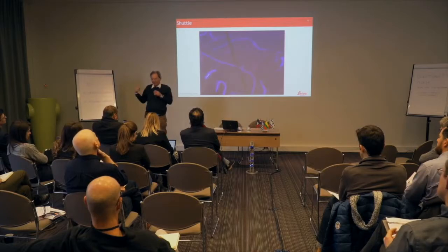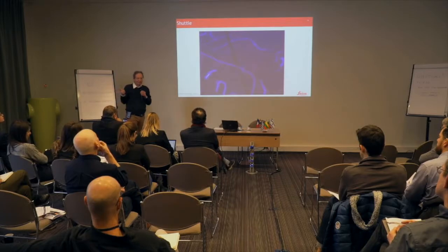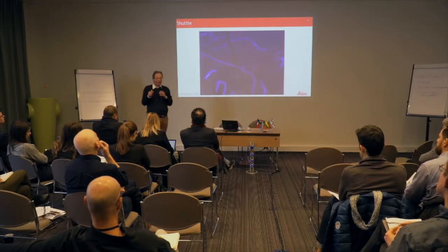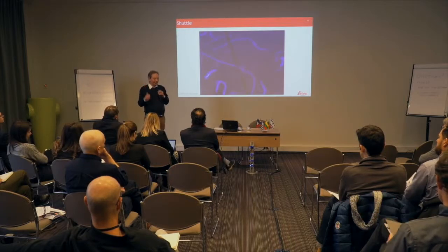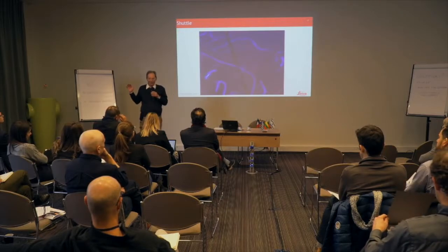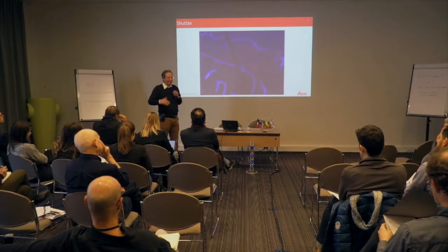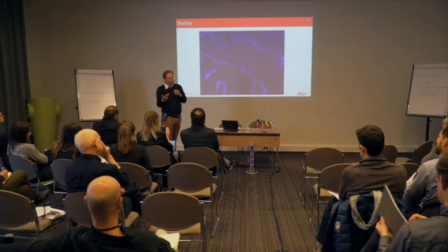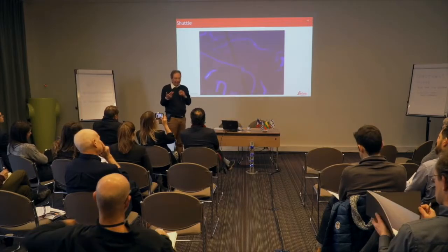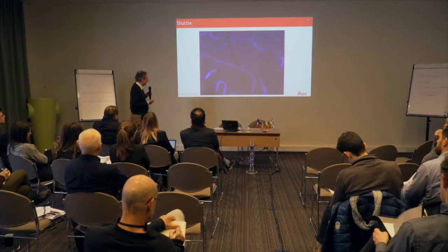So, just to summarize that, A4 will need for a single scan something like 14,000 single images at the resolution you want. You will require eventually Z-stacking of I don't know how much, depending on how big the particles are that are in that foil package or in the tape package. We have a problem with polarization here that, again, we cannot solve. We need something that is non-polarizing.